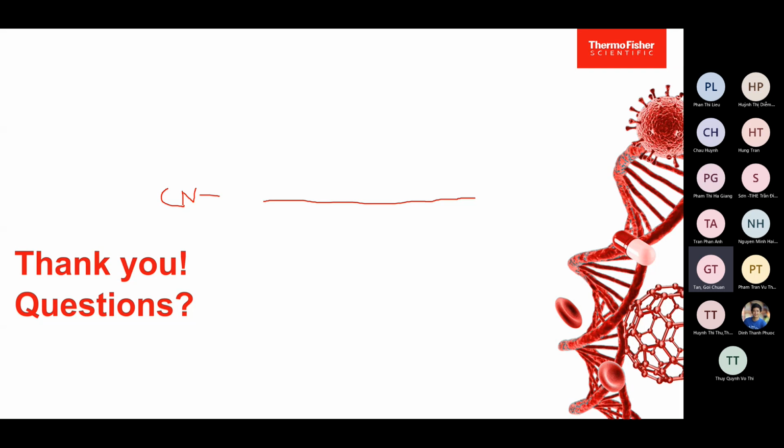I think this is copy number 0. Let's say the signal for copy number 0. And then we actually have the signal, the reference for copy number 1, and this is copy number 2.